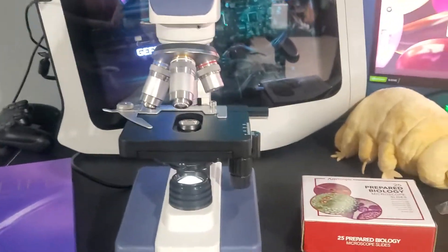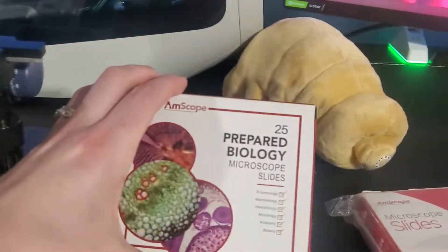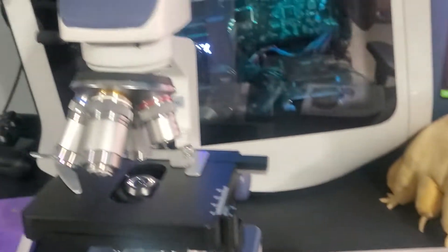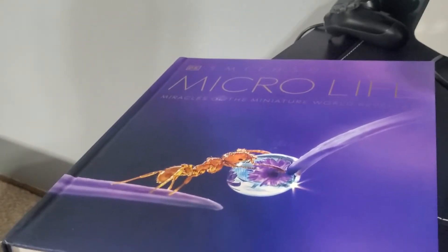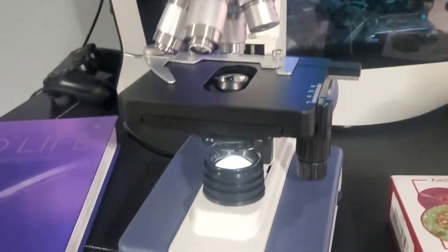So that's a quick look at what I'm working with over here. I'm excited — in the future we'll be looking at these slides and looking for a tardigrade. I just wanted to show you all these different products that we're bringing together to make this work happen.